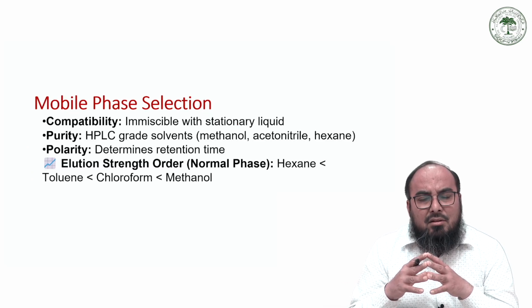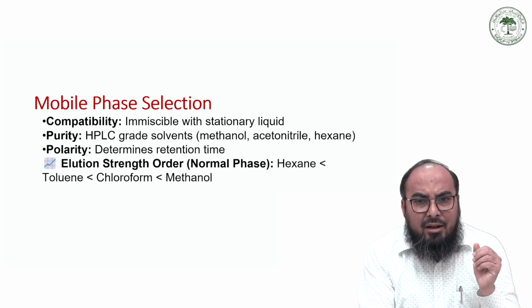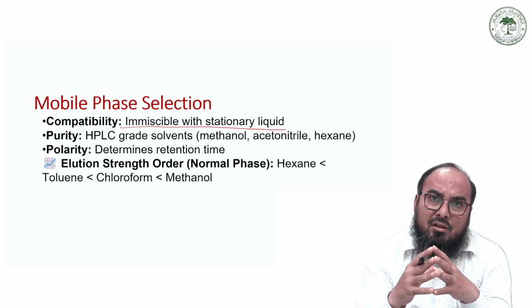For the mobile phase, there are certain parameters on which we choose it. Again it should be compatible, that it should not dissolve the stationary liquid.